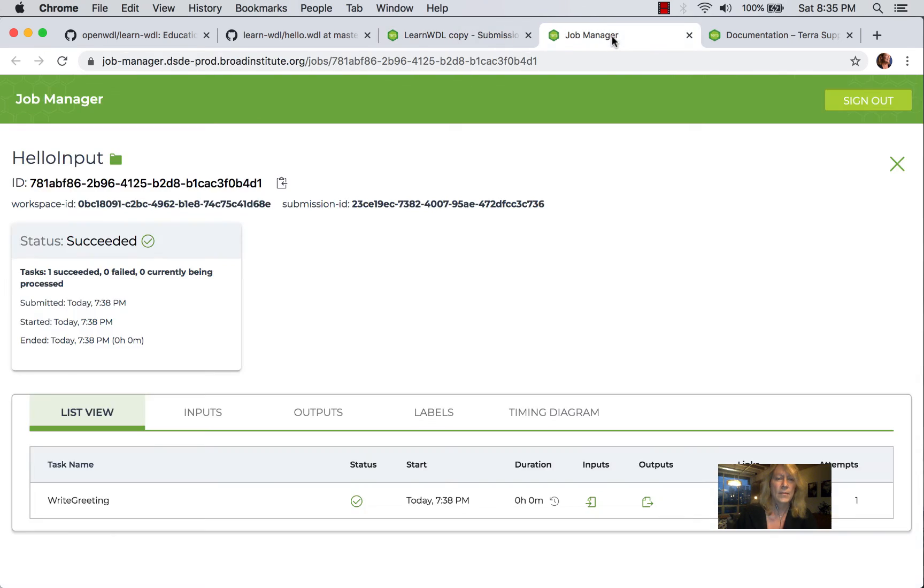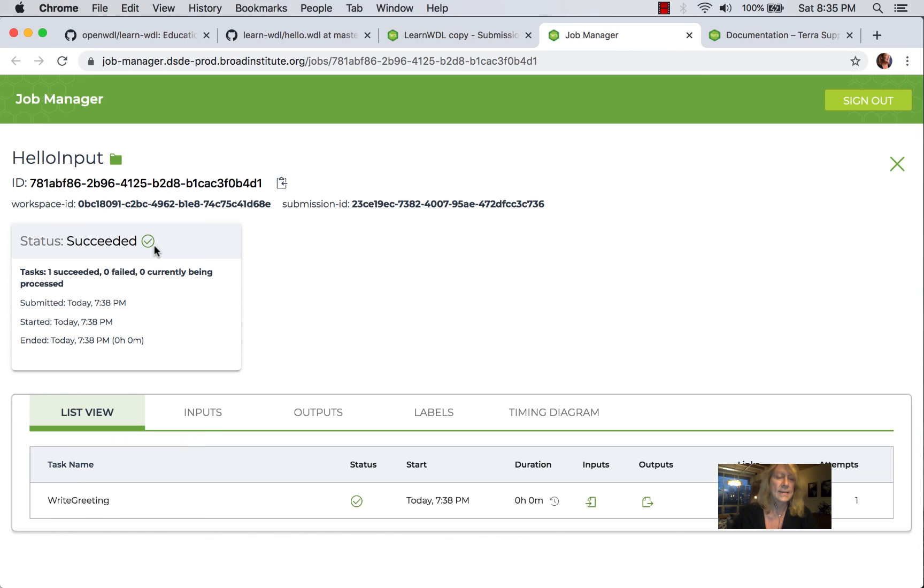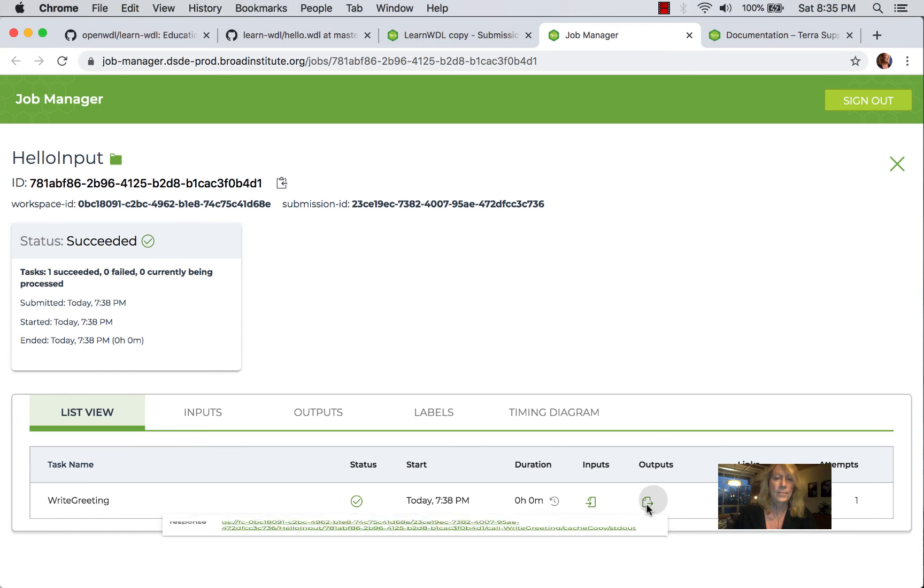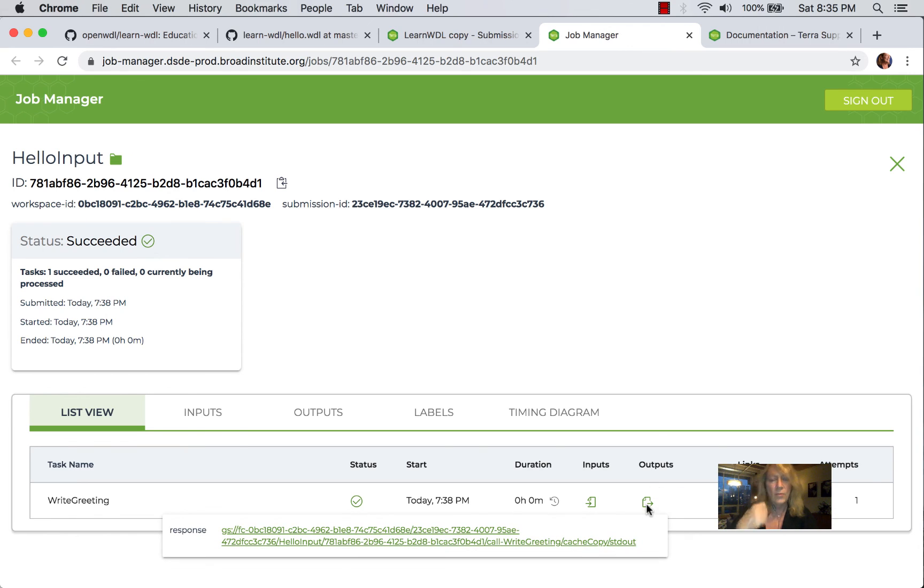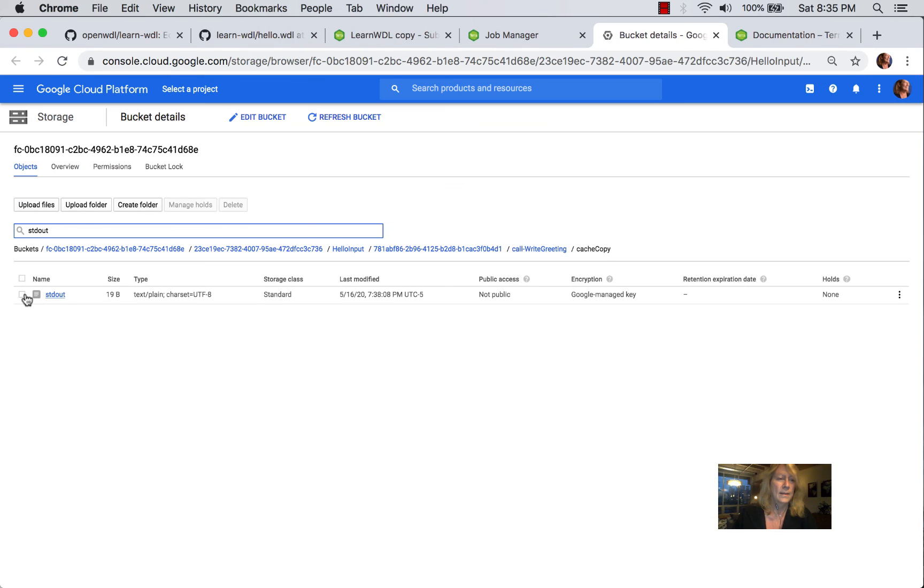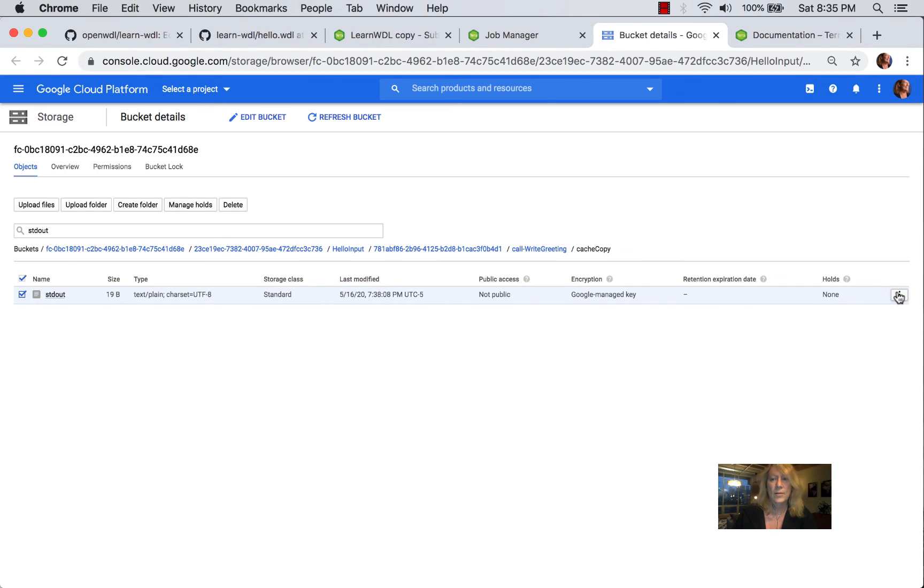Now because this takes a minute, what I did is I went ahead and I ran this already. And you can see then once it succeeds, you get a success. You can then look at the output. And that will be in a Google bucket. And then to see the output, you just download it. And there's our Hello Input world.